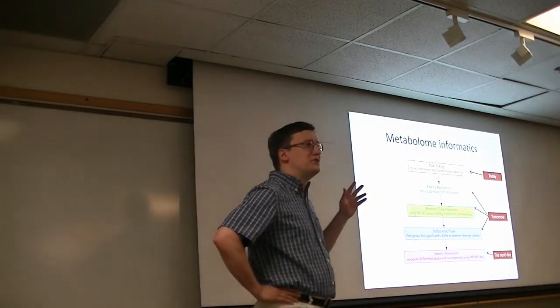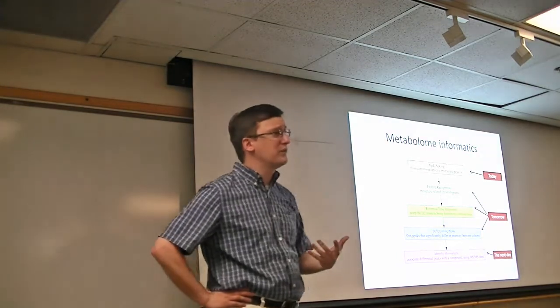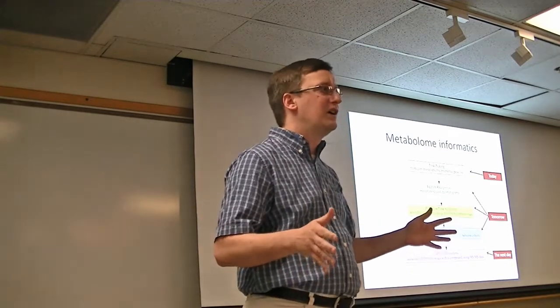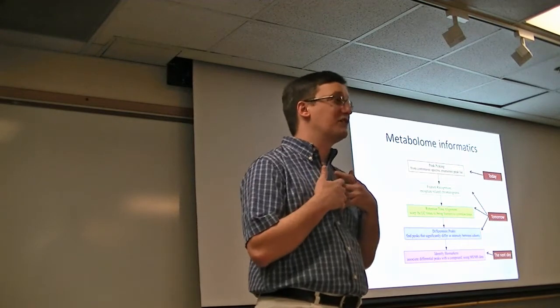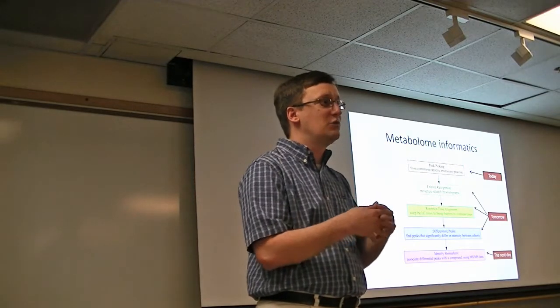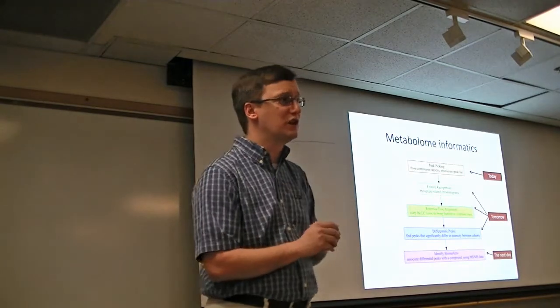How people do metabolome informatics differs quite a lot based on what kind of data they're working with. And as a result, it's a little ambitious to say that I have one workflow that covers what people do in metabolome informatics. I'm accustomed to teaching, of course, in protein identification. And for most of the labs out there doing protein identification with shotgun proteomics, the workflows are pretty straightforward and quite similar to each other.